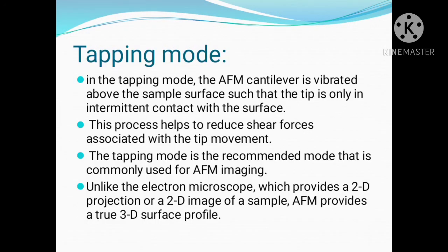Tapping mode. In the tapping mode, the AFM cantilever is vibrated above the sample surface such that the tip is only in intermittent contact with the surface. This helps to reduce shear forces associated with the tip movement. The tapping mode is the recommended mode that is commonly used for AFM imaging.